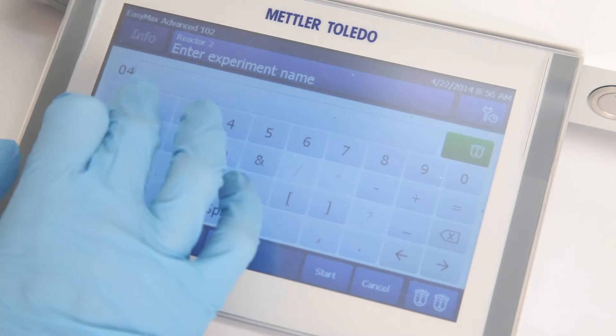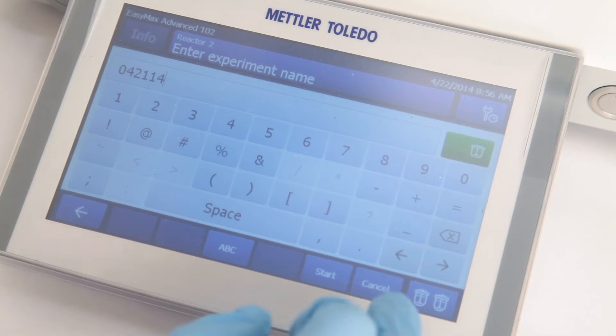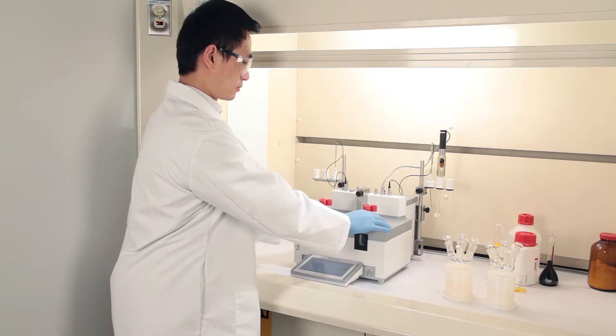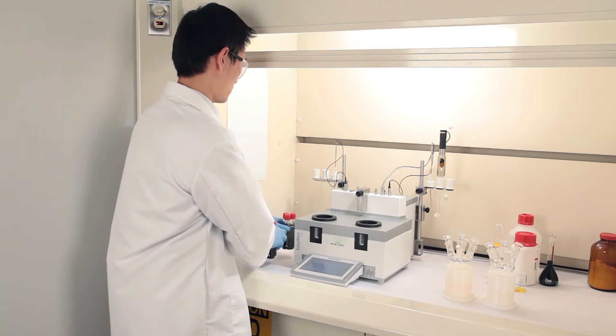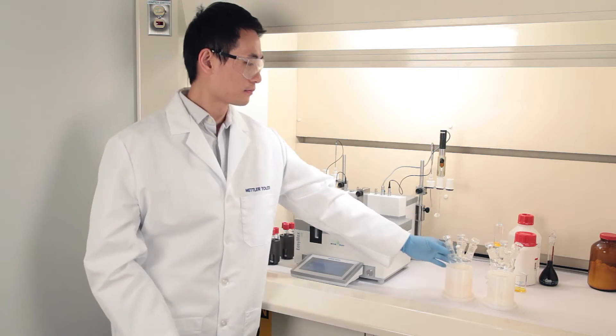This instantly familiar platform provides flexibility and ease of use, eliminating the need for manual methods like ice or oil baths and heating mantles.